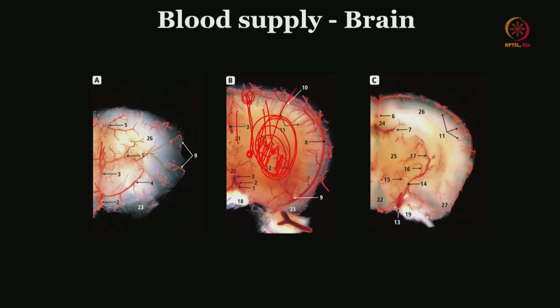So, of course, there is a way that you are going to master your trajectories involved in the targets. Best is to replicate exactly what the literature says, try and replicate the similar trajectory, try and replicate the exact coordinates that you are dealing with, because those coordinates are built upon the experience of various surgeries, alright.